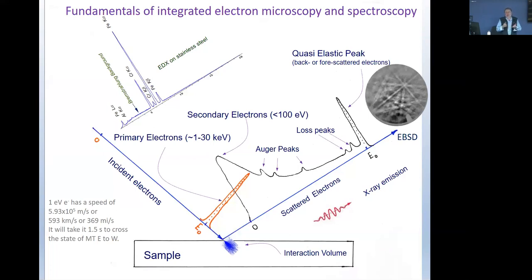Typically, for example for American Chemet, we are looking at the surface of their copper particles, 1 nanometer. So we have to take it easy, maybe half a nanometer intervals. The sputtering rate depends on the energy of the argon, which we adjust anywhere from 500 eV all the way to several thousand eV, and the rate goes from sub nanometer per minute all the way to 10 to 20 nanometers per minute. Thanks.